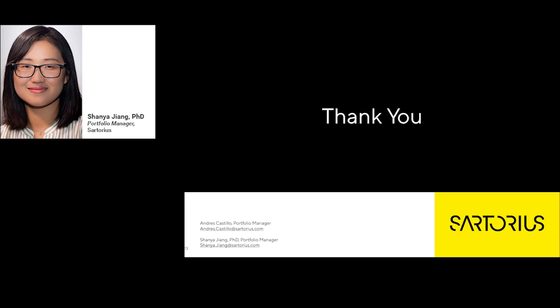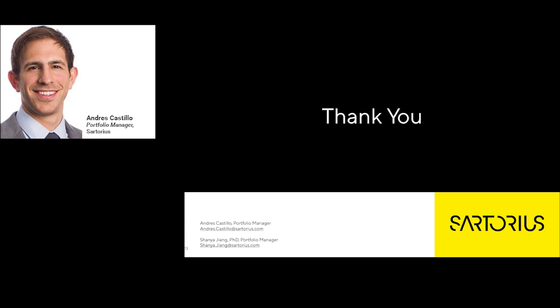The last question for the webcast is, how would you select a good scale-down model? Yeah, I can jump in here. So obviously, a scale-down model is really just a tool for cost-efficient development and characterization of the processes. What you really need is the space to test all the parameters and the inputs that you want to test. You need the consistency as well, so maybe relying on automation within it, and then you also need the ability to measure the parameters in the process that you're developing as well.